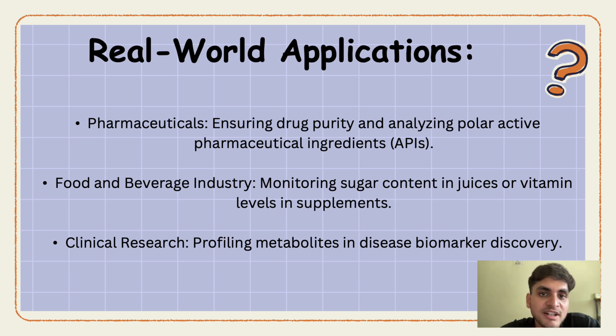In the food and beverages industry, monitoring sugar content in juices or vitamin levels in supplements. And in clinical research, profiling metabolites in disease biomarker discovery.